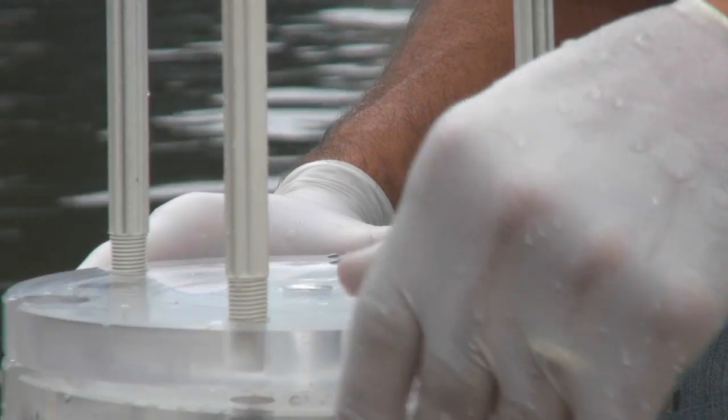We're putting samples of the water into the spiral filter, pressurizing it, and that pushes the water through that fine, fine mesh filter.